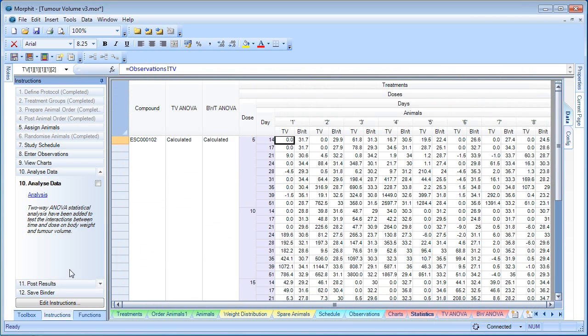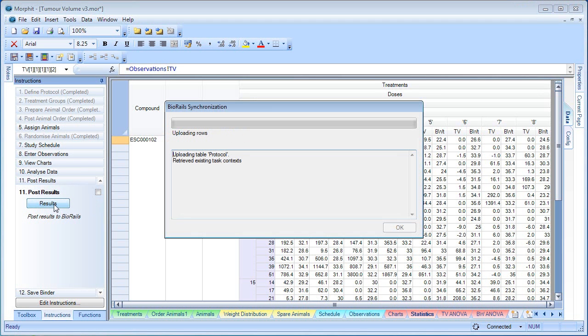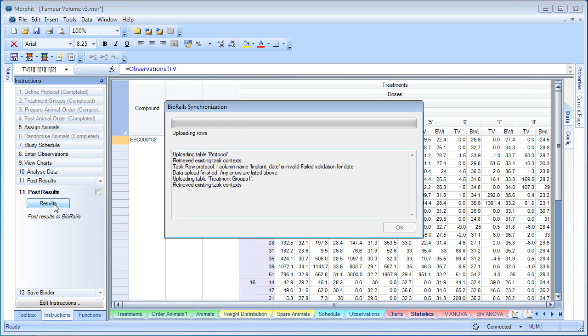The final stage is to post the results, the endpoint data. In this case, we'll be posting for each of the treatment groups, for each of the test groups, the average and standard error of the tumour volume and body weight. This is populating all the tasks in the BioRails experiment.